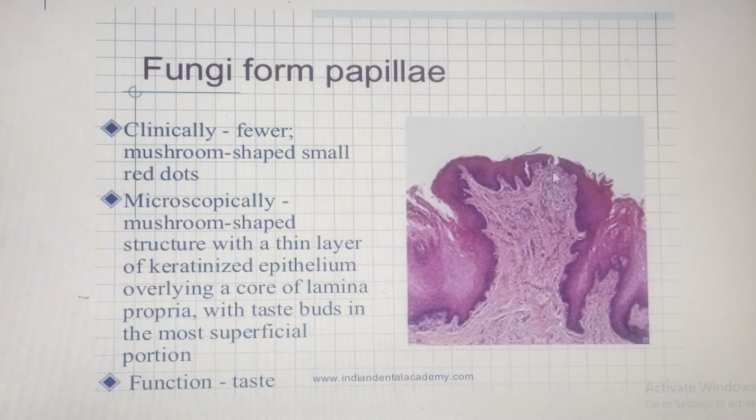Yes, the one which you can really describe as being mushroom shaped. But one thing that is striking over here, because mushroom, yes, the crown over there, the superior portion, that is where the taste buds are located. So yes, of course, you have the epithelial pegs, you have connective tissue papillae, and on the crown, or the superior portion of the fungiform papillae, that is where we have the taste buds.